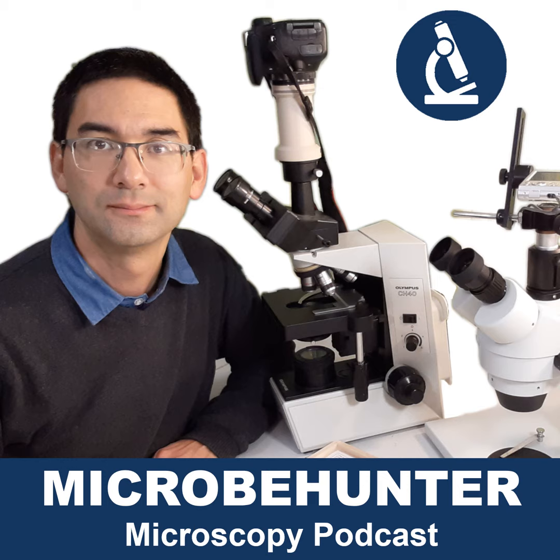That's also quite possible. So this basically gives you a total magnification, because the eyepiece that you look through, you have to include this in the calculation. 4 times 10 gives you a total of 40 times magnification. Then the 10 times objective with the 10 times eyepiece, 10 times 10 is 100, of course, and then the highest magnification that you can get is 400 times with 40 times 10.